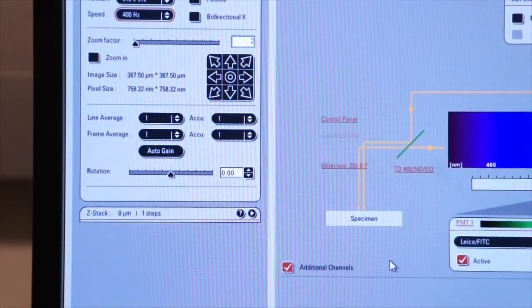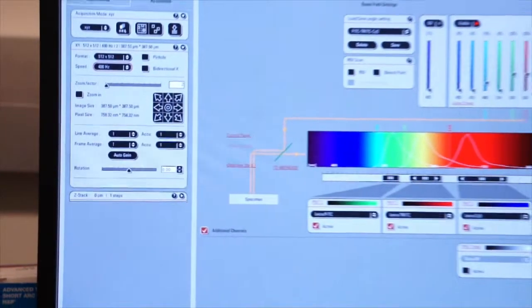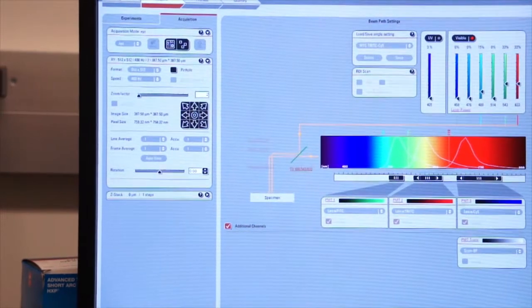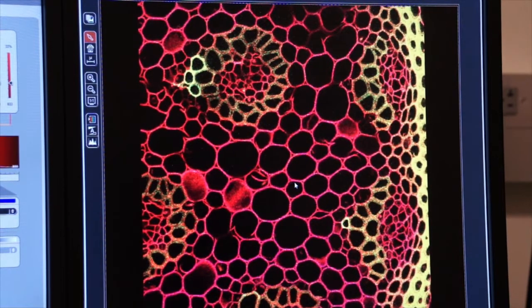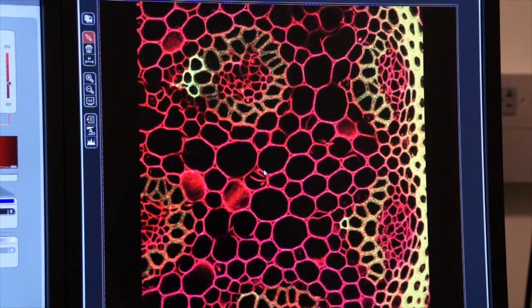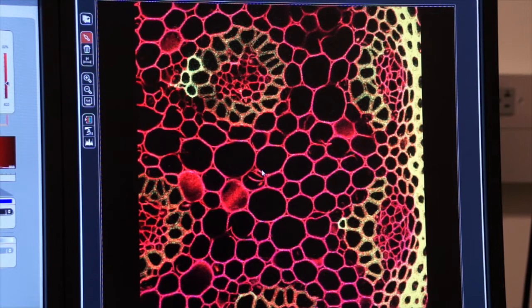We will go down and click on capture an image. Let's capture an image of our specimen and here you see all three of our fluorophores and our composite image. So that's a 512 by 512 image.